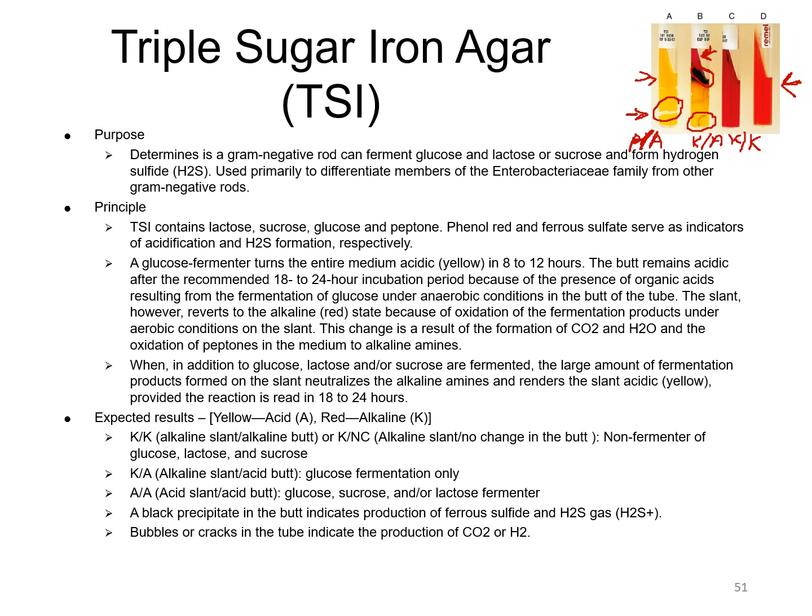Depending on the organism, sometimes it will just shred the agar and it'll be broken up all the way through, but most of the time you'll have just a little bit. Sometimes the agar slant will actually push up from the bottom, so there will be a little layer of air at the bottom, and then all of the agar would be through here.